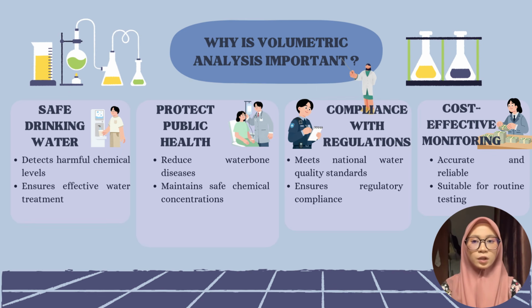In addition, volumetric analysis helps water treatment plants comply with national regulations and water quality standards. Finally, it is a cost-effective method because it is accurate, reliable, and suitable for routine monitoring. Therefore, volumetric analysis remains an essential analytical technique for maintaining safe and sustainable water resources.